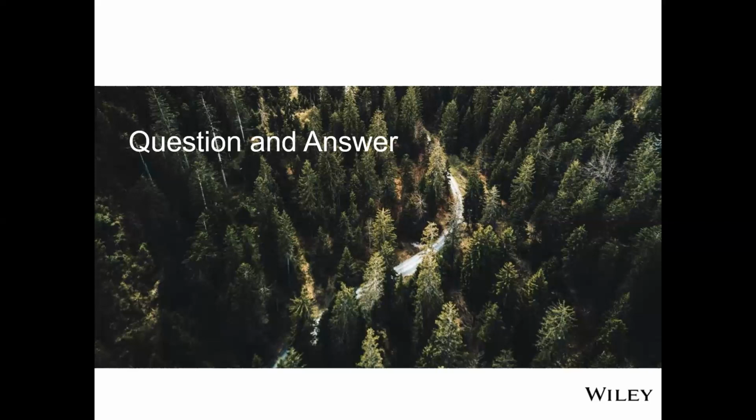So we went that path, and we really have not had a problem whatsoever because we're very good about educating our users that this is an aid to interpretation. There are things that might be incorrect in here, but we also tell them there might be things incorrect in the NIST and Wiley because we're always finding things in those commercial databases that are not correct. So bottom line, it's such a powerful tool. You push the button, it looks so easy, but you need to be careful. It's a powerful aid to identification, but you as the user need to make sure that the data is good before it's sent out, because if not, you'll lose confidence with your customer. And so you need to be careful.